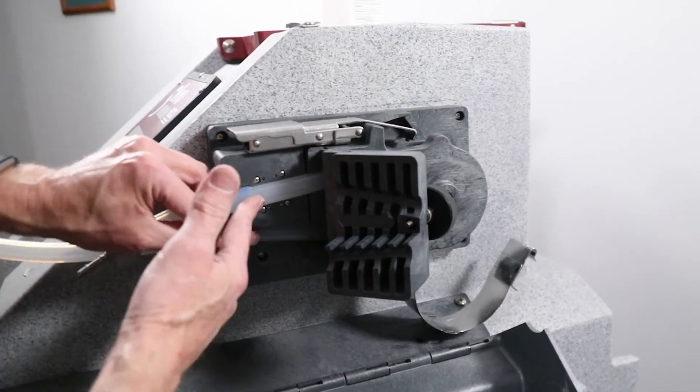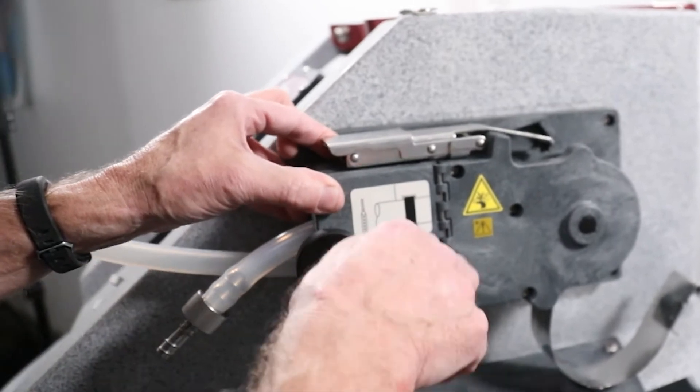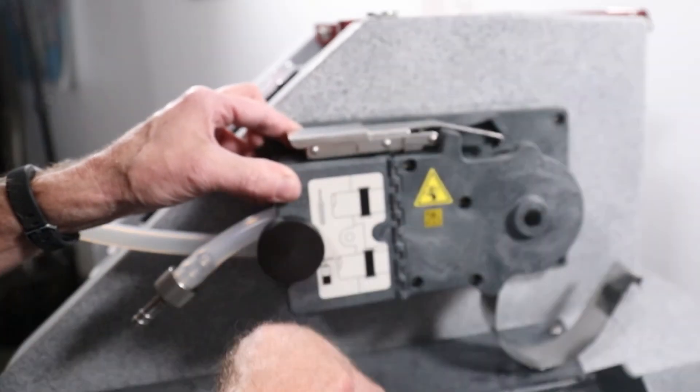Align the blue bands to fit into the grooves of the liquid detector base and close the liquid detector cover by tightening the thumb screw.